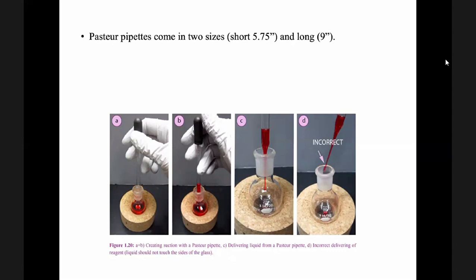Okay, sir. Okay, sige, welcome. Okay, so balik naman today. Where are we now? Letter C. Now, delivering liquid from a pasteur pipette. Amo ni siyang tsakto klasa. Ito nga. Incorrect. One is letter D. Incorrect delivering of reagent. The tip should not touch the sides of the flask.